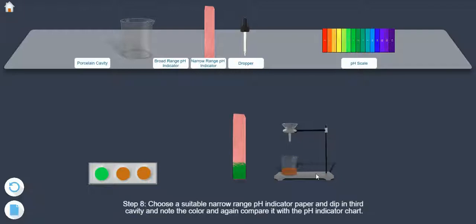Step 8: Choose a suitable narrow range pH indicator paper and dip it in the third cavity and note the color and again compare it with a pH indicator chart.